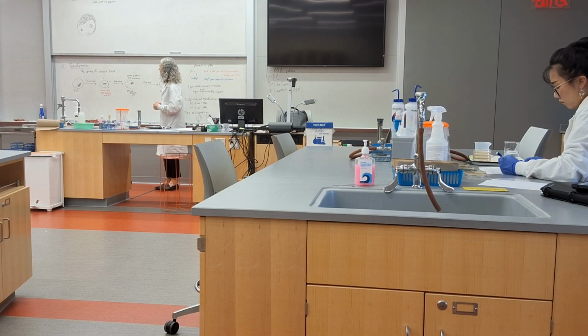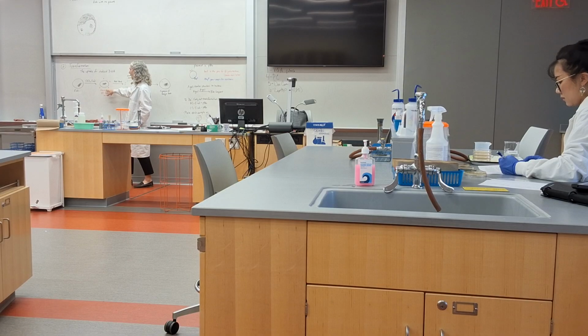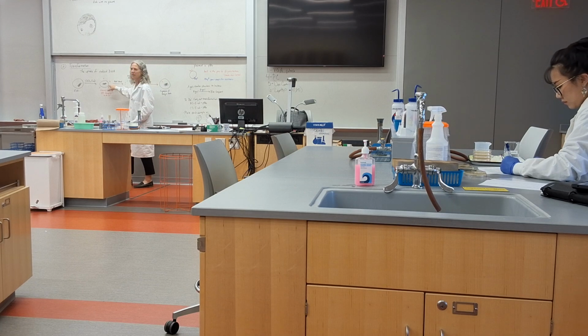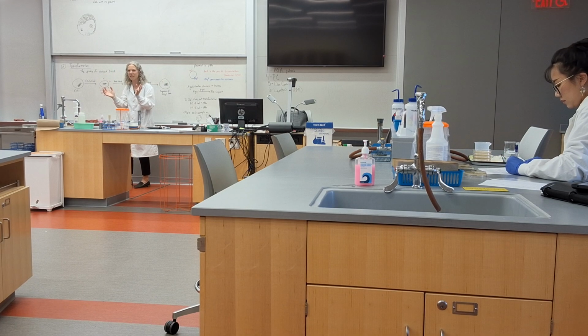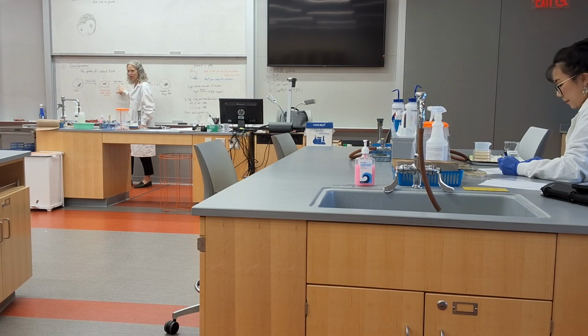Transformation. Okay. So we start with E. coli. That E. coli is put on very cold calcium chloride, makes it really cold. We add the plasmid. Now this plasmid is foreign to it, right? In order to have this uptake of naked DNA, and by naked we mean there's nothing around it. There's no vesicle around it. There's no capsid like a virus. It's just a DNA molecule. Okay, so we add the plasmid, and then this is our method of transformation, heat shock.